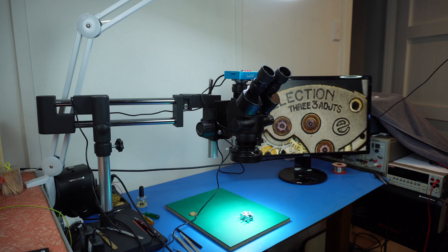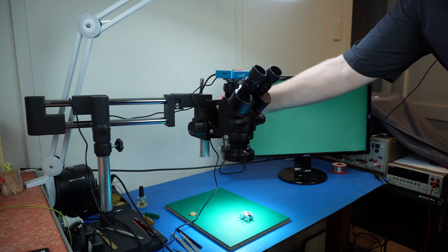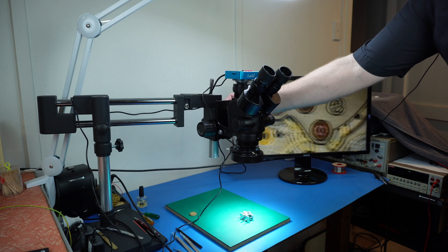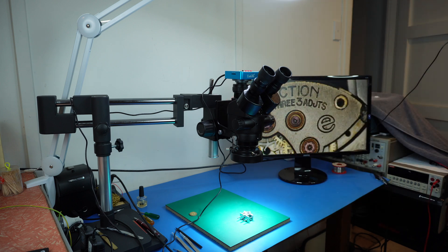As you can see this is the double arm version - there is a single arm version as well, so you've got a fair bit of flexibility. This sort of slides back and forth like this. One thing I will note is at full extension it wants to fall over. The base is very very heavy, but even with that heaviness at full extension it wants to fall over. So if you wanted to use it at full extension you need to either add some weight to the base or clamp it down to the desk.